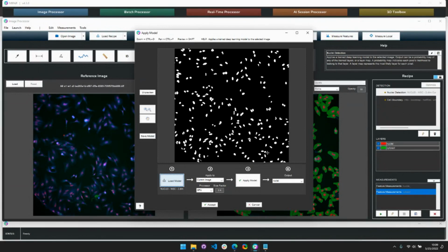Anybody who has very little to no experience with image analysis will be able to very easily pick up the nuclei from this image, right? That's kind of the power of deep learning. It's able to simplify fairly complex solutions for us. But relative to some other problems in life science, being able to find the nuclei is very straightforward.